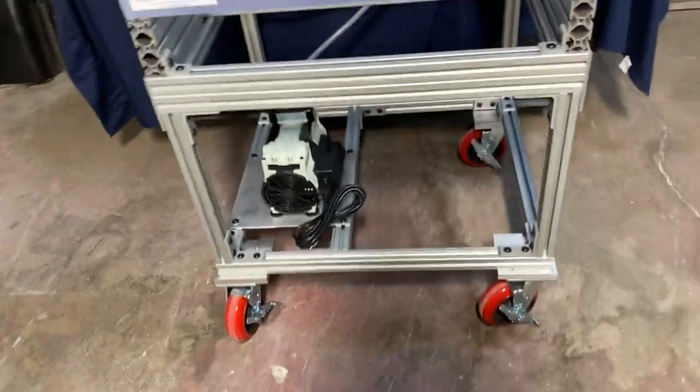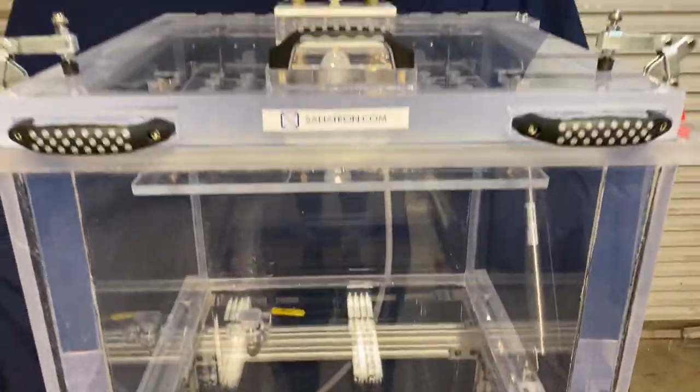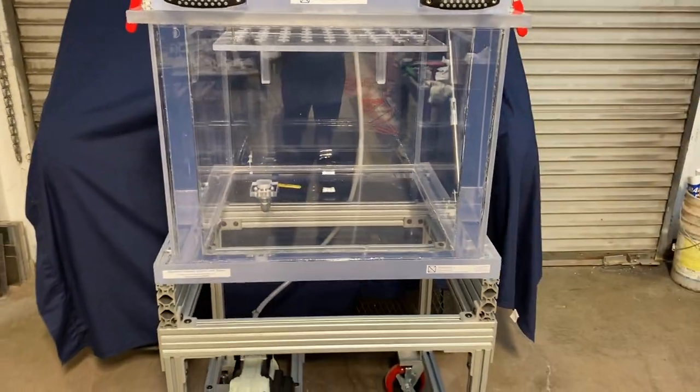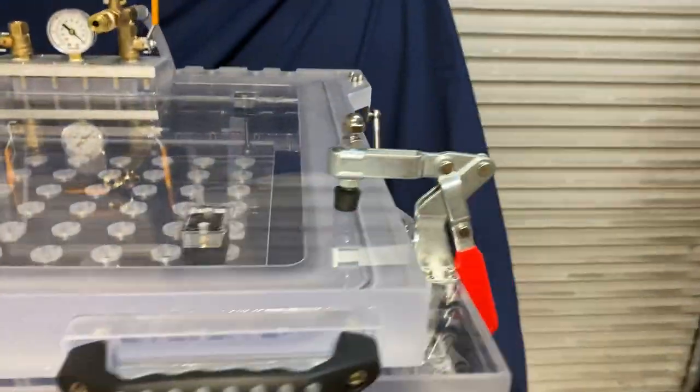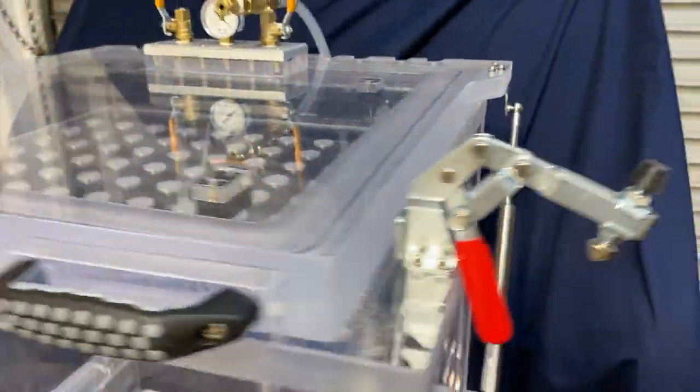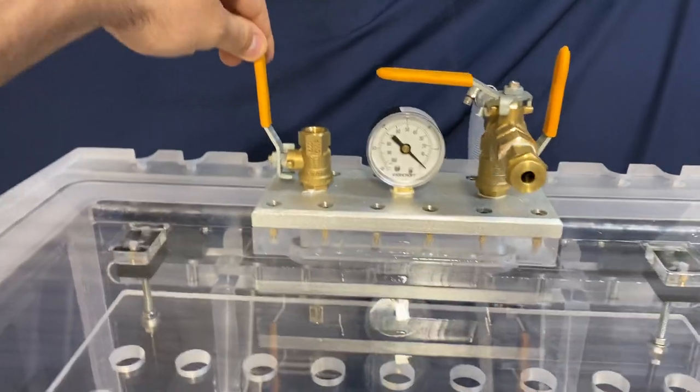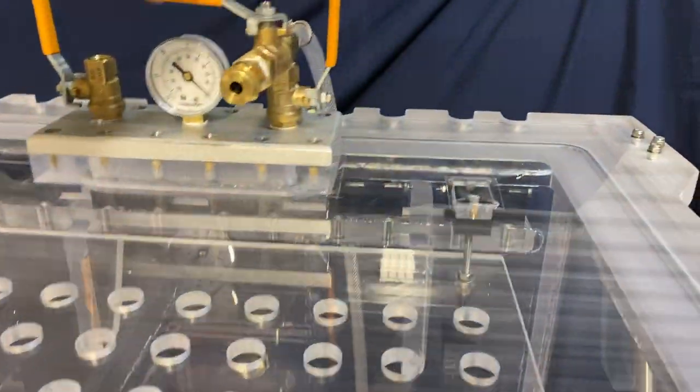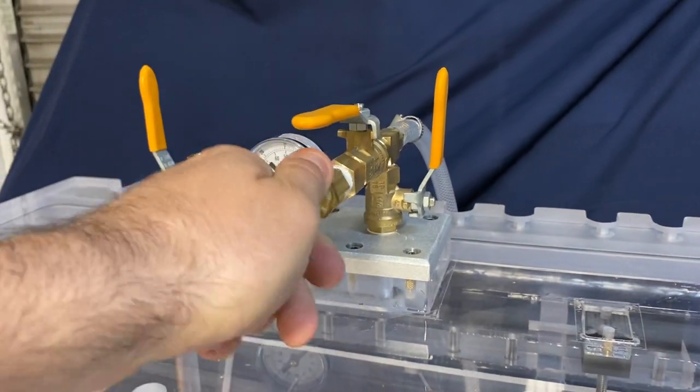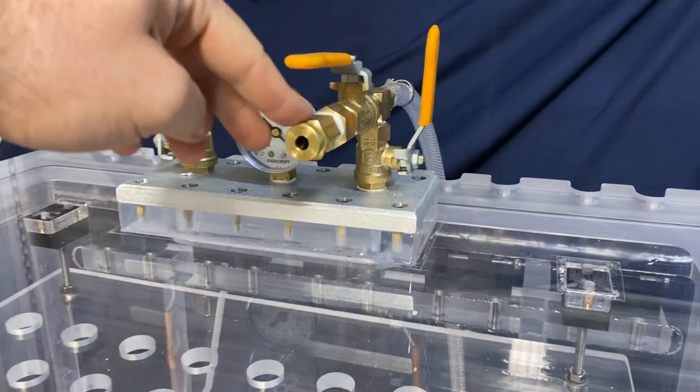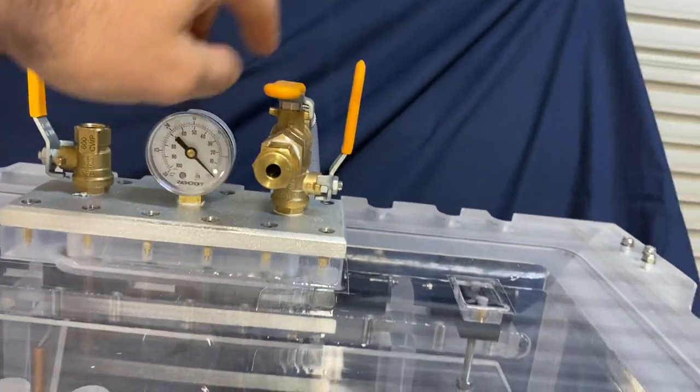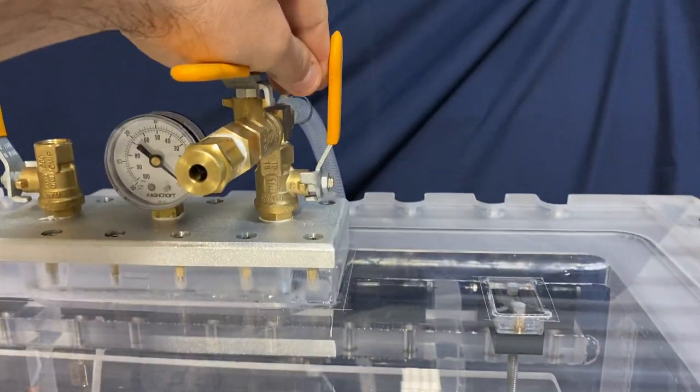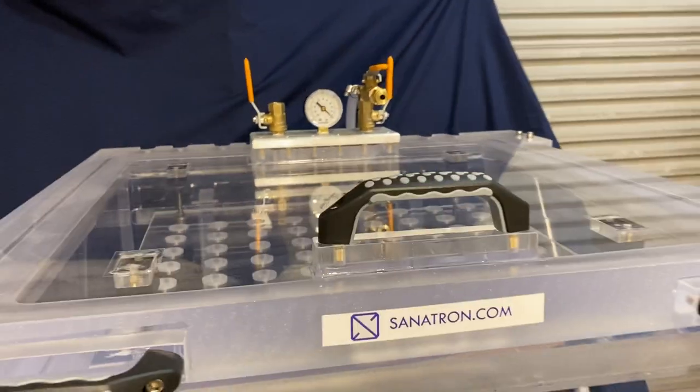Moving on, this bubble leak testing system also has two clamps right here, one lid clamp and another lid clamp that you can open and they get out of your way. Another cool feature of course this comes as a standard is a venting valve that you close when you want to pull a vacuum. You have a vacuum adjustment valve that you can twist to essentially increase or decrease the vacuum, it's a bleeder valve that essentially keeps your vacuum at a certain level that you adjust and then of course the vacuum valve.